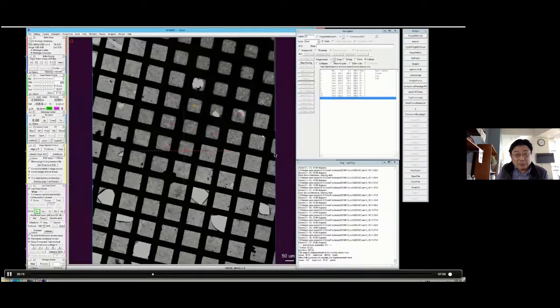Okay, so as I mentioned earlier, we try to work relatively quickly to get things done, but you don't want to waste time here. So we hope to collect useful data. In any way, we very quickly select areas of interest. Then I want to check it. So I go to number 45, and then the stage moves there.